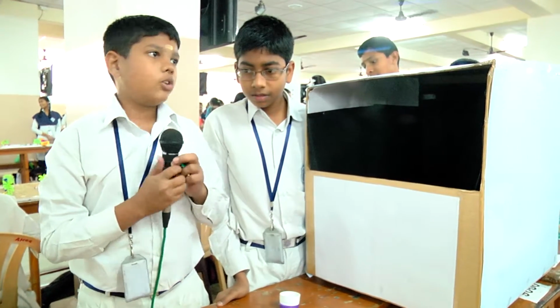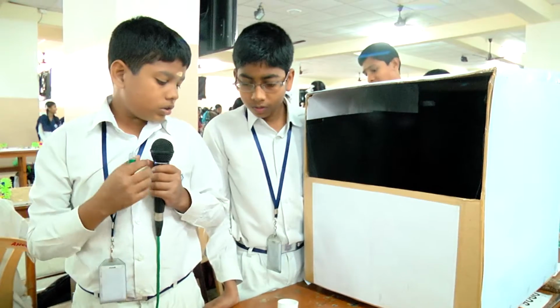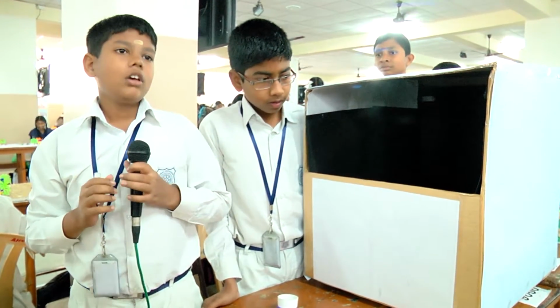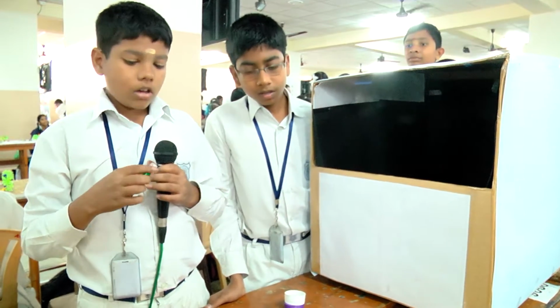I am going to talk about low cost microscope. If we need to see a microorganism in the water, we need a microscope. It costs more money.